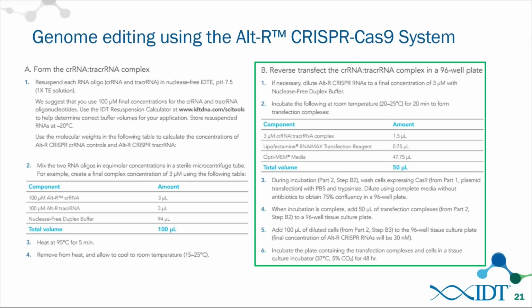So we really recommend, and any further follow-up with our scientific applications group would really require assistance to be directed based on what you see with your positive and negative controls. So we recommend those good scientific practices.